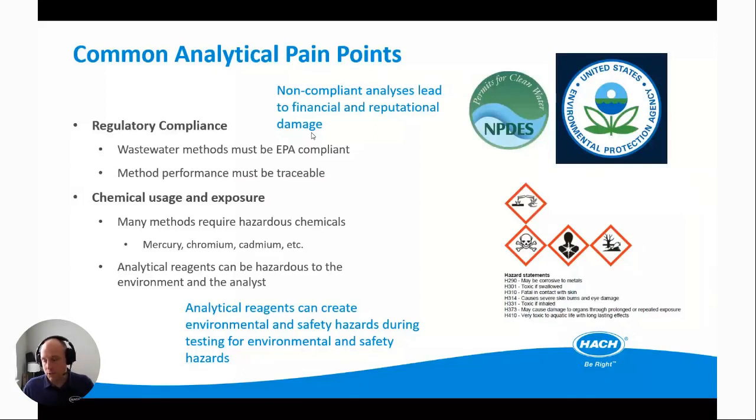And like I said, this is just ammonia that we're talking about. There are a number of other nutrients, and not just nutrients, but other analytes that are necessary to measure in water, in your wastewater in particular, and it could be a host of things depending on your permit situation. So all of these things compounded in a representative lab, you might be doing any number of these analyses and dealing with all these pain points across multiple shifts and multiple operators every day.